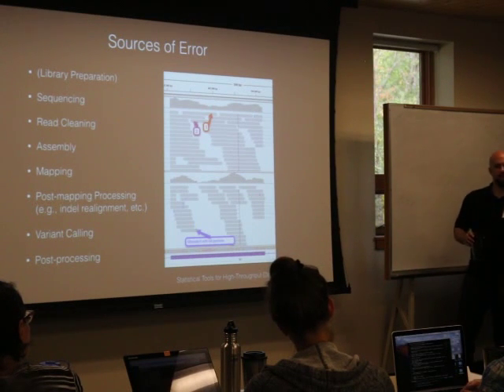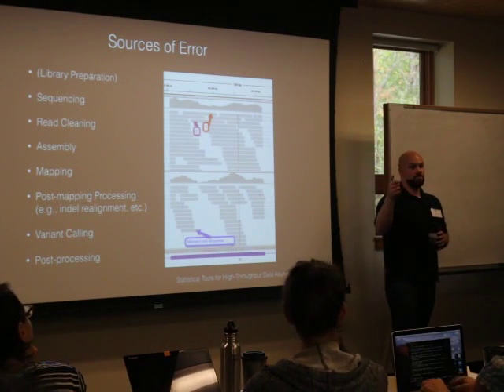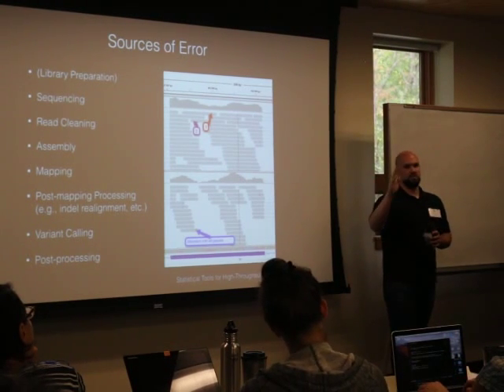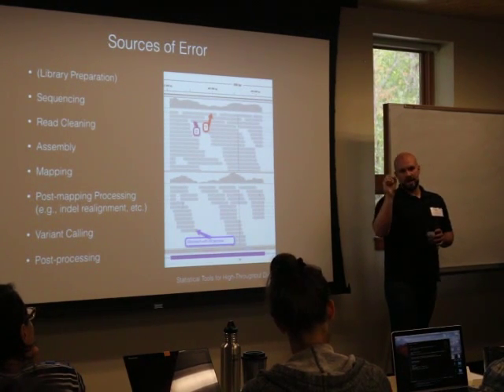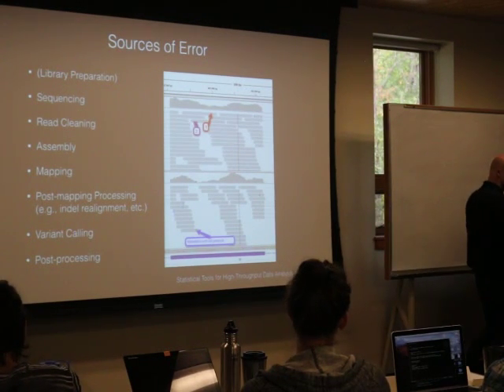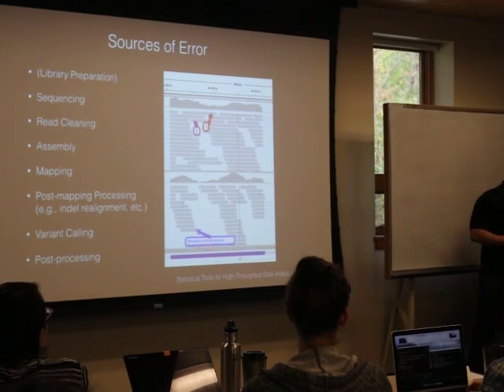Indels are particularly tricky, informatically speaking, if you're not calling haplotypes. So you can imagine you have an insertion or deletion in a particular base, but your reference genome, whatever that is, has the opposite. So maybe a reference genome position is an A, you have a deletion of that A in your particular sample that you're working with. And then accounting for the appropriate position of that is a little bit tricky. I think I mentioned that a little bit in the handout. You can also throw out things that you have no certainty about where they are in the context of the genome, et cetera. Then you can go through to variant calling.